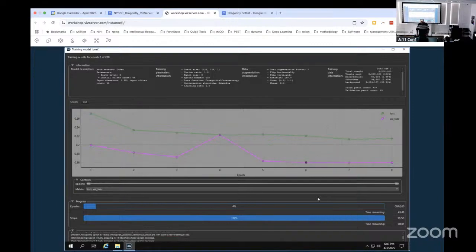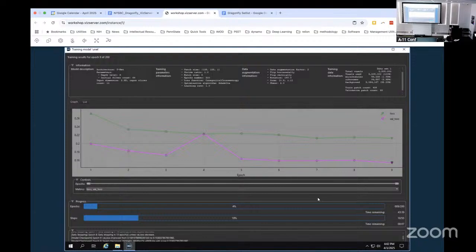I see people work with some. So we want to do is low. Example, for us, data. There's no. I actually guess. Every time I try to get them confused. Click on that animal. Yep. That is so. Oh, okay. Go down. Oh, you want it to go down.